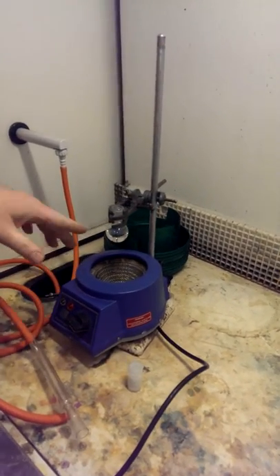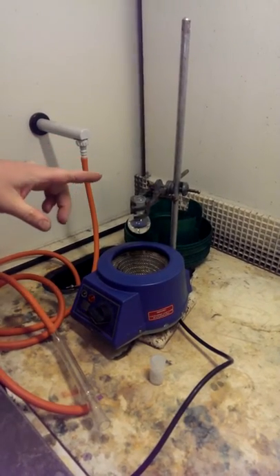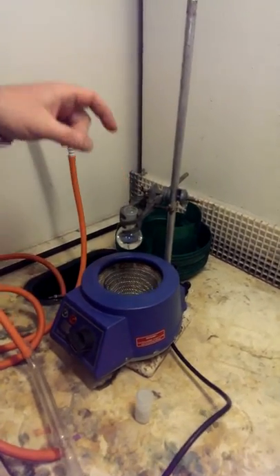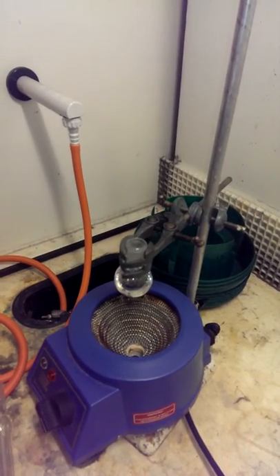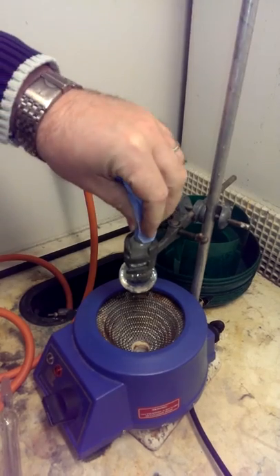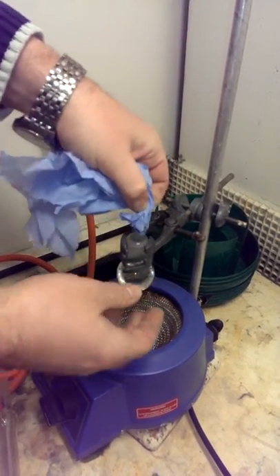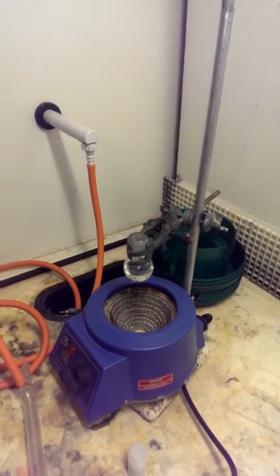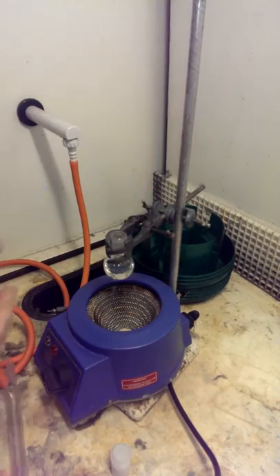So we have in here an organic solution that we wish to reflux. First thing to say is that if the neck isn't clean or it looks visibly dirty, it's best to take some tissue paper and clean the neck of the flask out. If you think just cleaning it with tissue paper is not enough, get some more tissue paper, wet it with acetone, and clean the neck of the flask out.